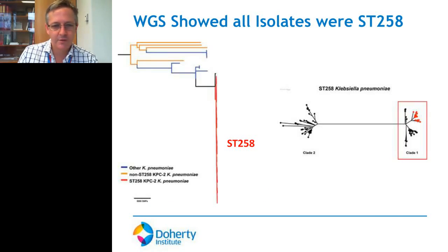And so we undertook some genome sequencing of the bacteria, and this is just a slide summarising where the bacteria all fit. So all of the ones that we'd had recently fit within this part of the tree here. And so this is a phylogenetic tree where the horizontal distance describes the diversity of the bacterial species. And so these bacteria here, which have a long branch length, are very different to the other ones, whereas the ones down the bottom here in red that have no horizontal difference are very closely related.